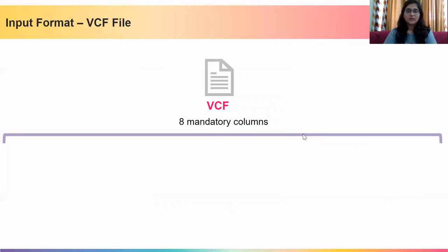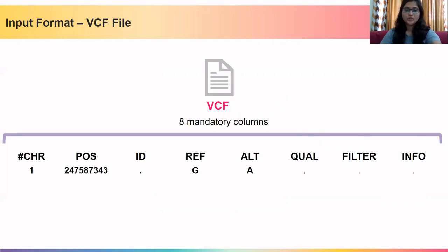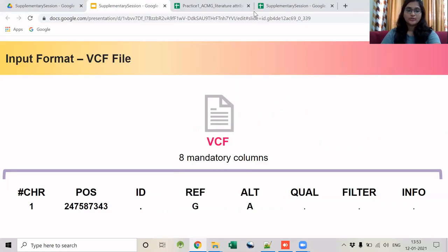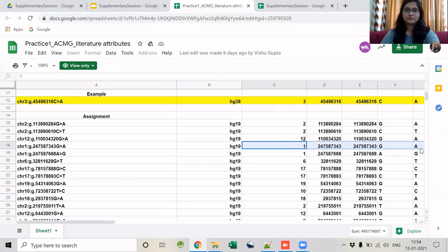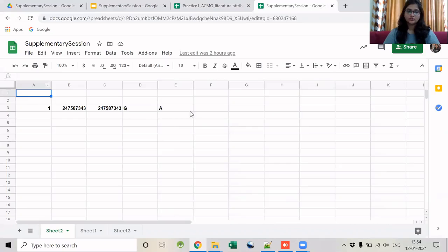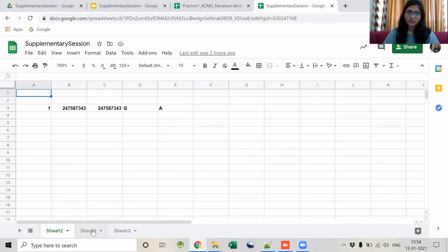So let us start with the session. We will begin with the VCF file which has eight mandatory columns. Today I am going to annotate one of the variants assigned in assignment 1 — specifically the fourth variant. This is the genomic coordinates of the fourth variant, and I will convert it into a VCF format input.